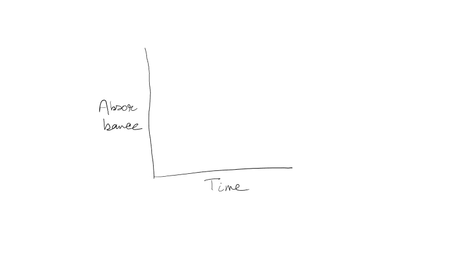As I was saying, the larger molecule will elute fast, so we will get a curve at lesser time, and just later after the elution of the larger molecule we will get the smaller molecule's curve.